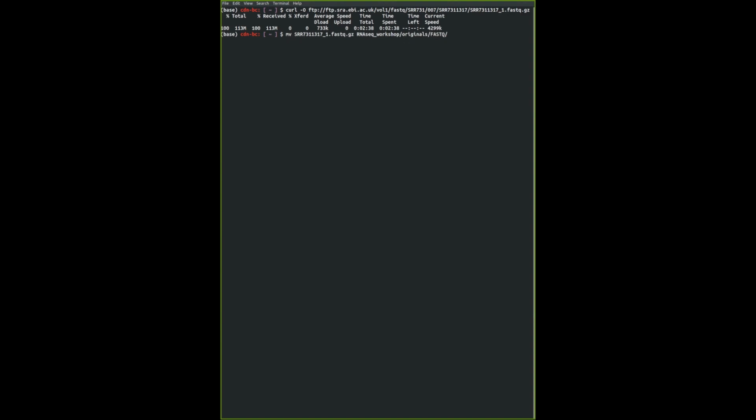How do you do the autocomplete? Yeah. So you press tab. To autocomplete quickly the file names or folder names, after you type a couple of characters, you press tab. If the name of that file is unique, it will immediately autocomplete the name. If there is some conflict, say several folders with very similar starting names, you might need to type in a little bit more and then autocomplete it.